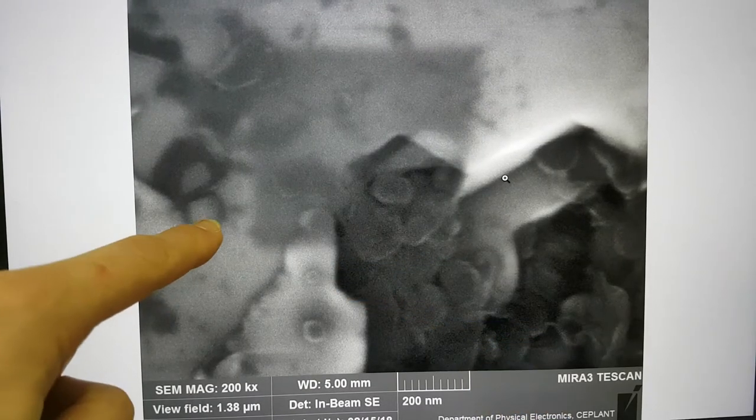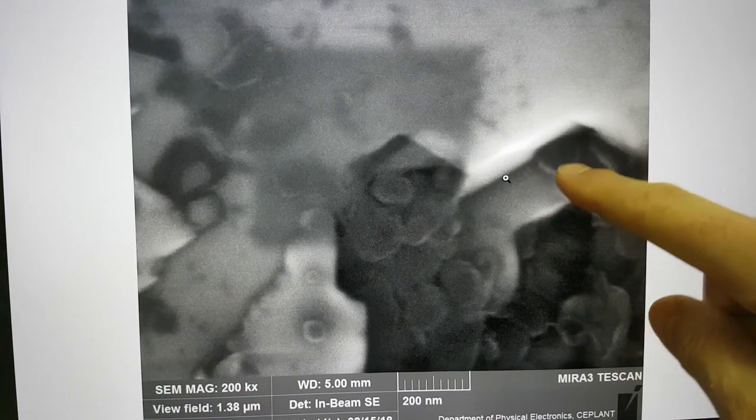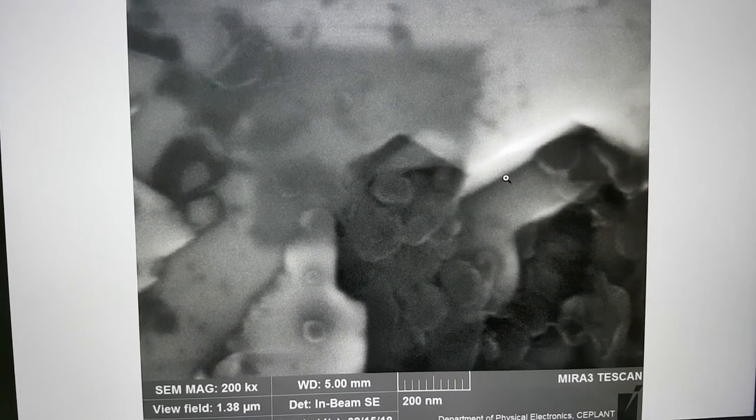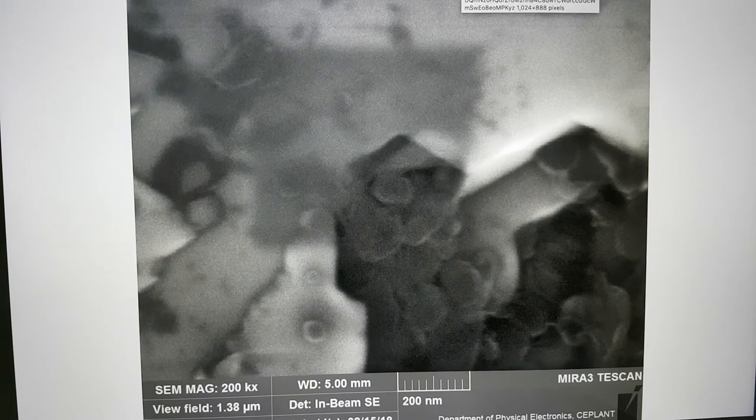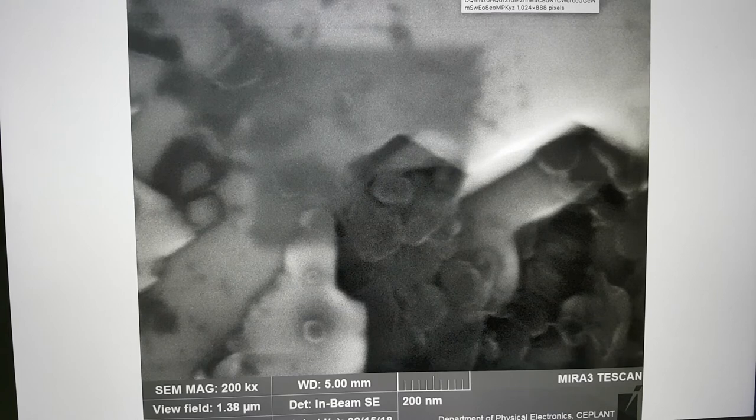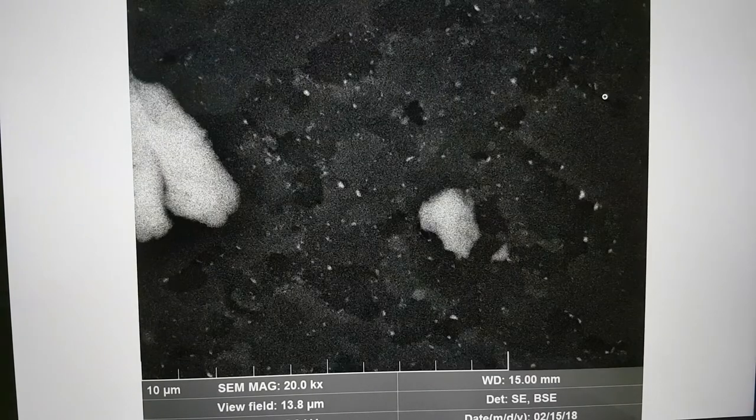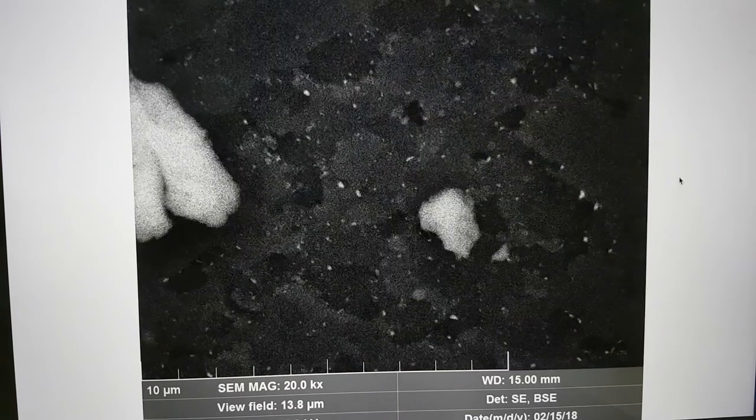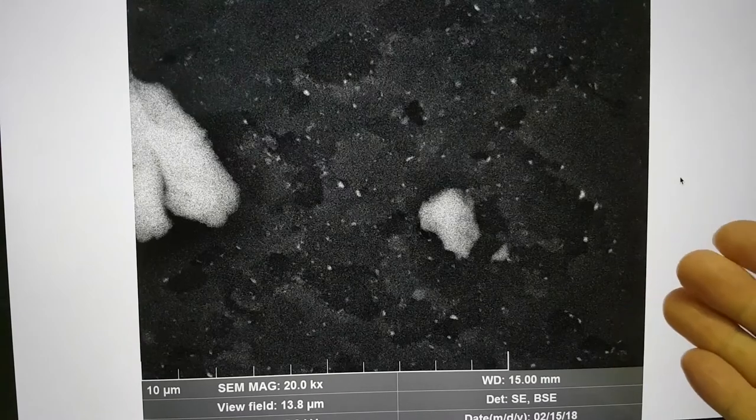We're going to look at this little area over here. You can see something's eaten out a hole here. This one's kind of on surface. This is a sphere but it's partly embedded over here. There's even a kind of little spiral here. Absolutely fascinating the way this has been eaten away. It becomes even more interesting when you look at the backscatter images compared to the normal SEM structural images. Here we have the structure with the backscatter.